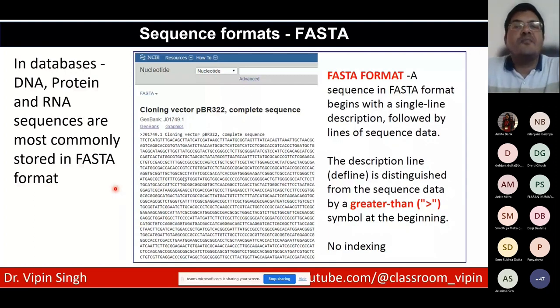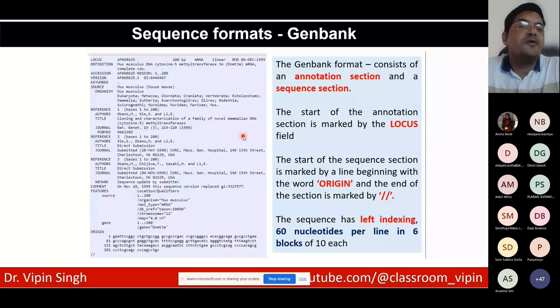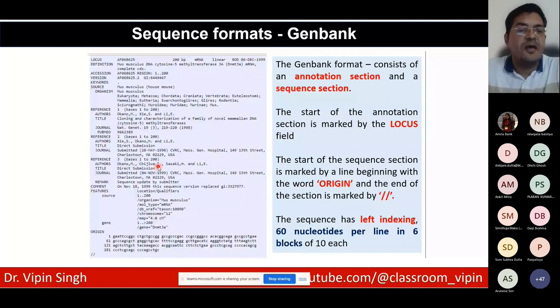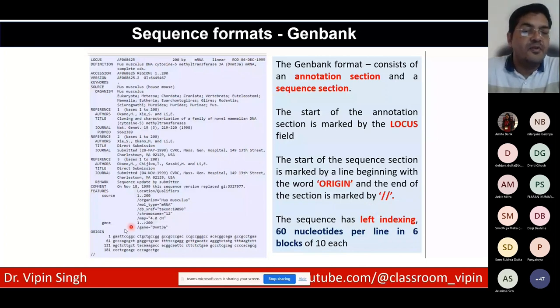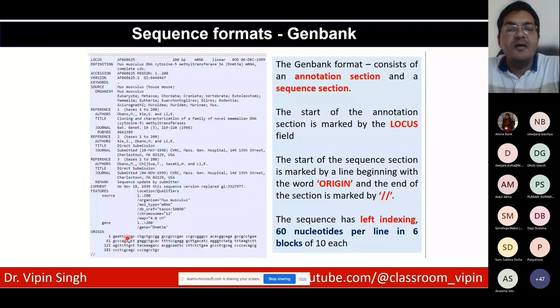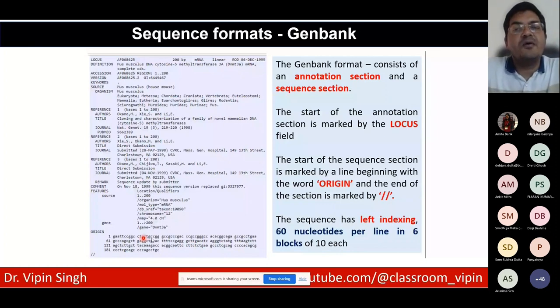The GenBank format includes both annotation and sequence. Annotation fields include locus, definition, accession number, references, and the journal where it was published. The sequence begins with the keyword 'ORIGIN' and ends with double slashes. Between these markers, there is left-side indexing with nucleotides in six blocks of ten each, giving 60 nucleotides per line.